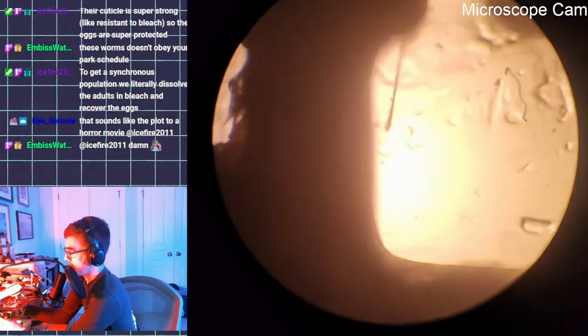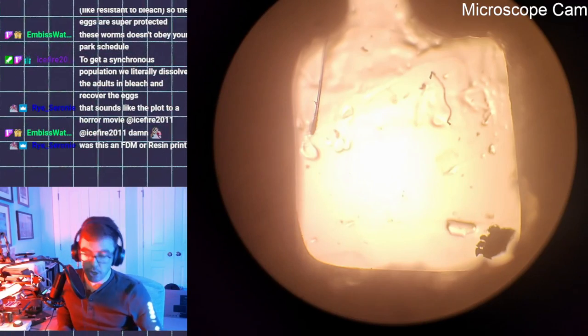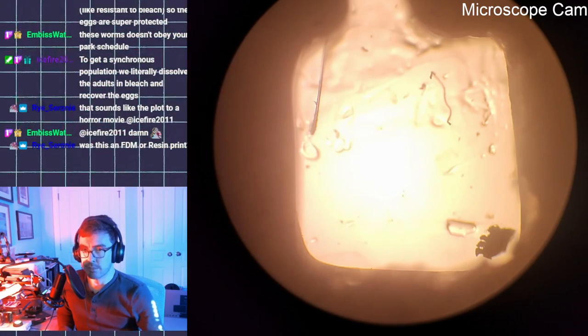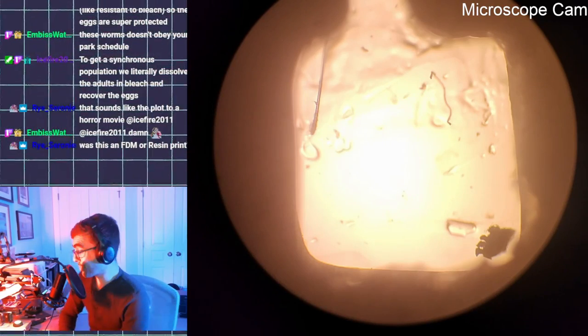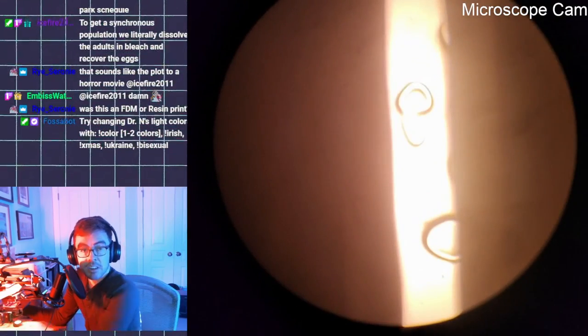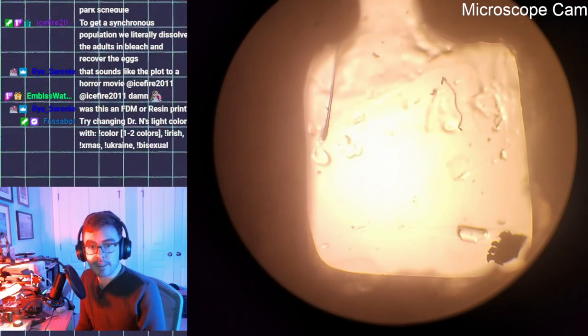Okay. So I don't know. This was FDM. I've been talking about it. I just haven't done it. On the campus that I work on, there are resin print services. I really would like to get something resin printed because I think that will bring the little bit of accuracy into this that I need. But honestly, I think this printed pretty well. These channels are something like 0.4 millimeters in diameter. Except for the odd little bit that's hanging out, they're pretty good, right? So yes, definitely could be improved, but it's good enough for now.